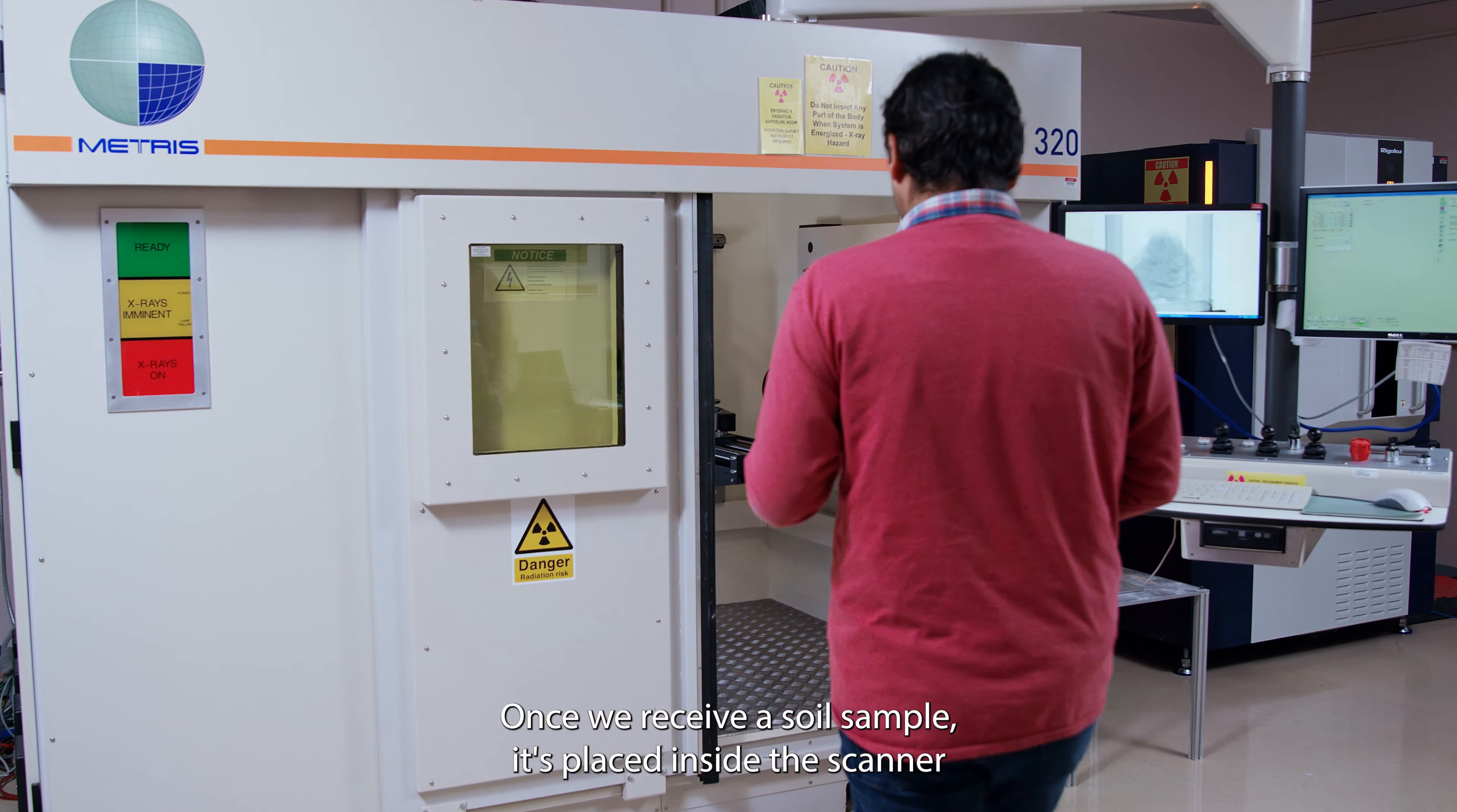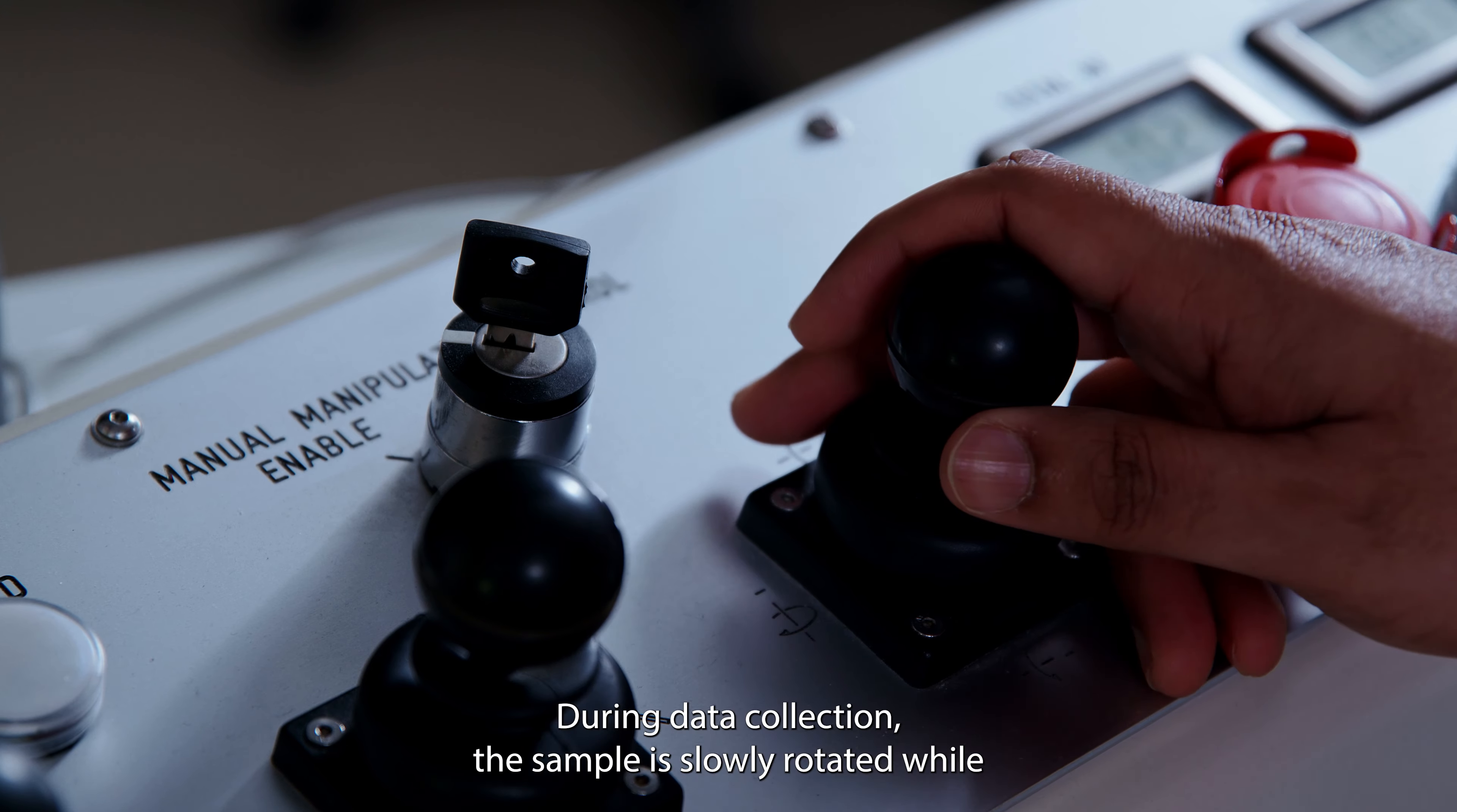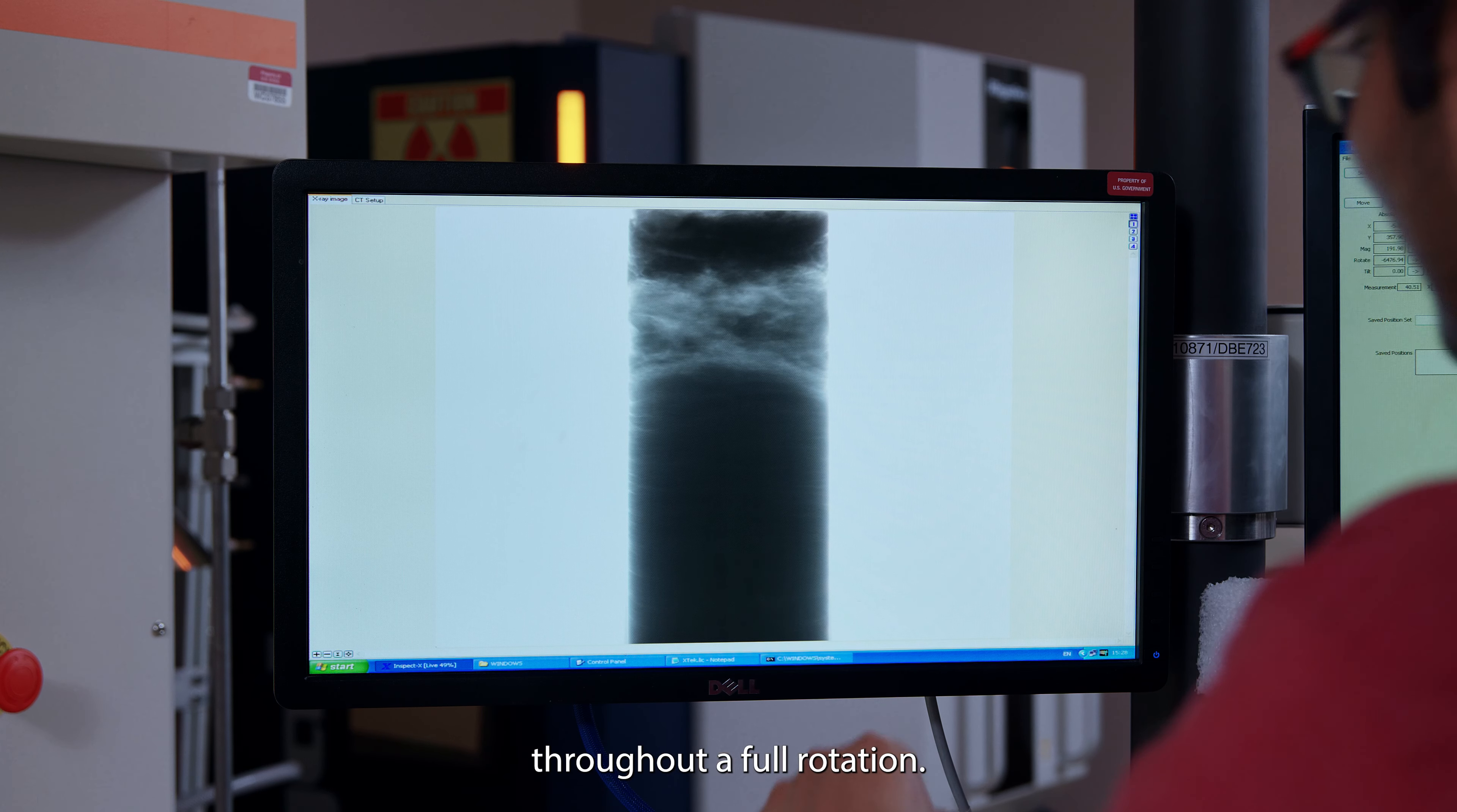Once we receive a soil sample, it's placed inside the scanner on a sample stage between the X-ray source and the detector. During data collection, the sample is slowly rotated while high-resolution X-ray images are recorded at many angles throughout a full rotation.